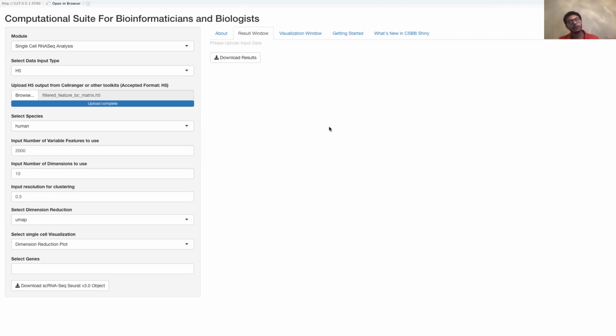By default, it uses log normalization, which is Seurat's default. But I'm planning to add SCTransform, which is a great feature Seurat has, where you can further normalize your data, clean it up, remove batch effects, and then show or even compare it.